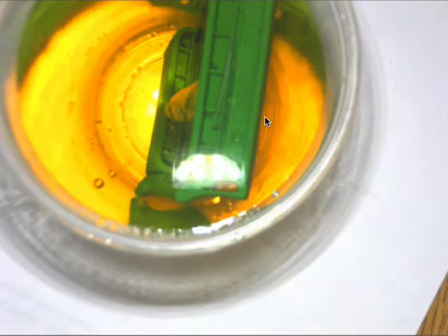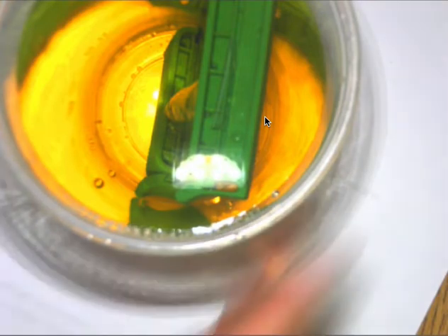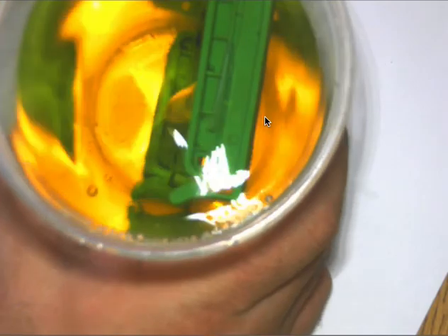now we wait. While you're waiting, hit pause and go to the while-you-are-waiting questions. Question 1: which molecule is larger, glucose or starch? Think about them. Which one's a monosaccharide? Which one's the polysaccharide? If you don't remember, go back to your carbohydrate section of your notes.